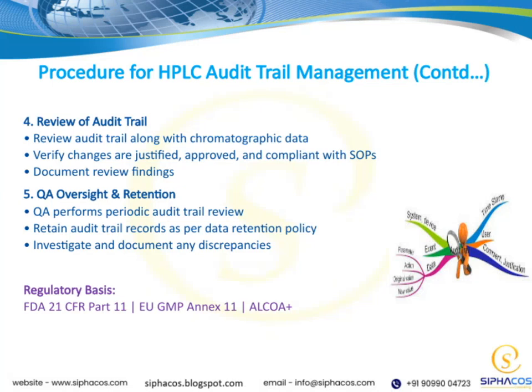Now, let's look at the review of the audit trail. It's essential to examine the audit trail alongside the chromatographic data to ensure everything aligns correctly. During this review, we need to verify that any changes made are justified, properly approved, and in full compliance with our standard operating procedures. Documenting our findings is a critical part of this process because it provides a clear record of what was reviewed and any actions taken.